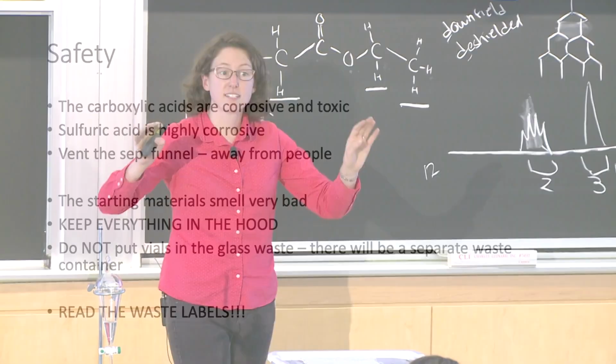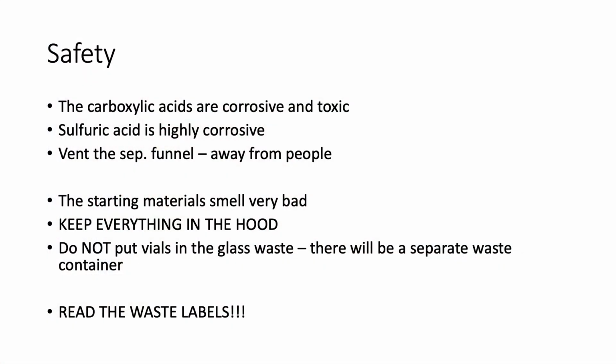Last but not least, safety for this lab is very important. The carboxylic acids are corrosive and toxic. They smell terrible. You can ask Tristan. He was the one who made all of the unknowns. And Brighton did the alcohols, so he got it slightly better, but Tristan will tell you that the carboxylic acids are very nasty to work with.